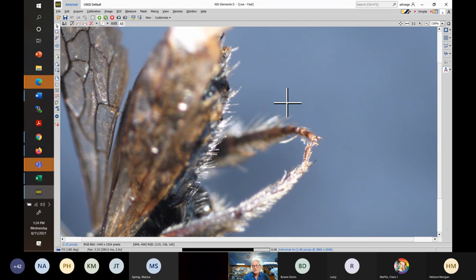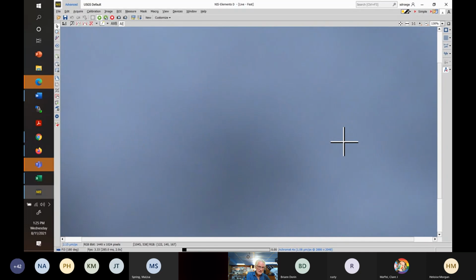In fact, you really do have to always look at the sternites because calcarata can have a full mark or a not full mark and still be calcarata. And I can't quite remember, but I believe every once in a while a micmaci will have a reduced mark. So the level of marking is not an absolute character. This one, though, is, but takes a while to learn. So we will be on micmaci in a second.